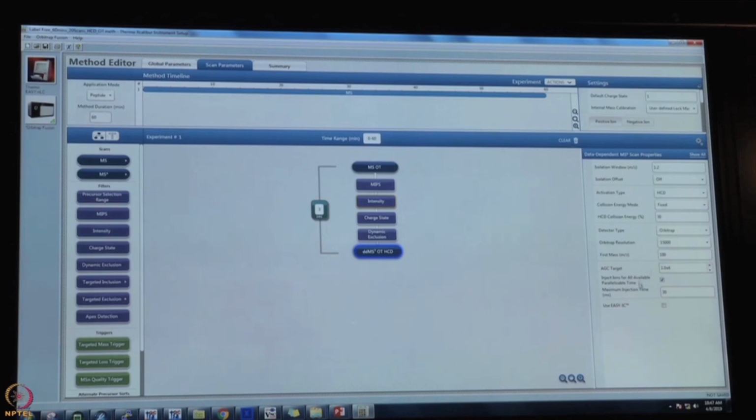So, these are the parameters which I have shown you. These are already optimized for the label-free quantitation. If you are using a different type of technique, if you are using a label-based one, in case of iTRAQ and TMT, accordingly those parameters will be changed. So, accordingly you can change it. So, this was the parameter for the LC and then the MS parameter.